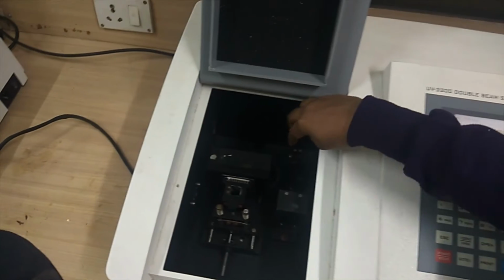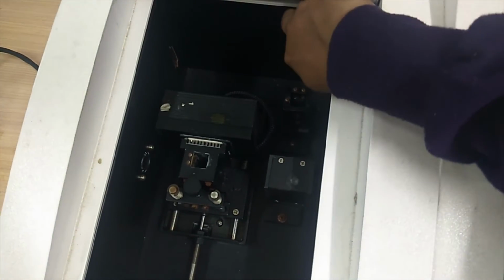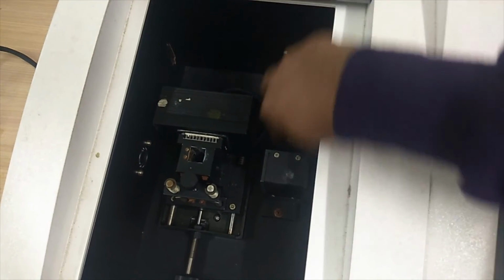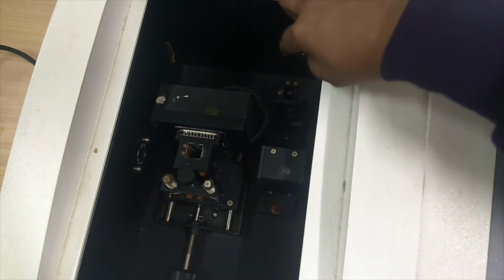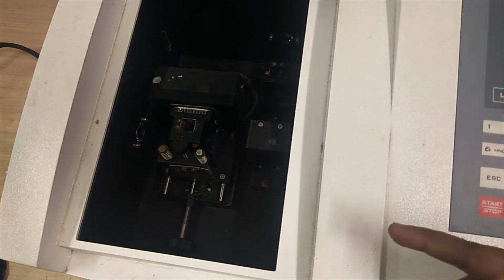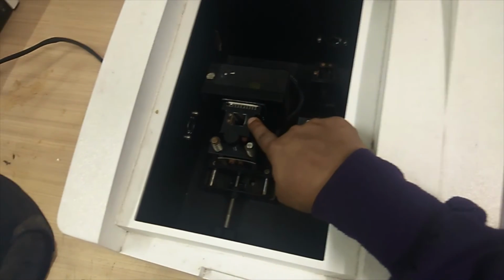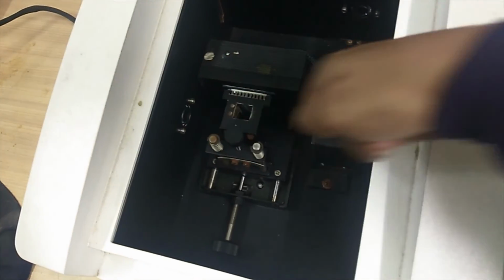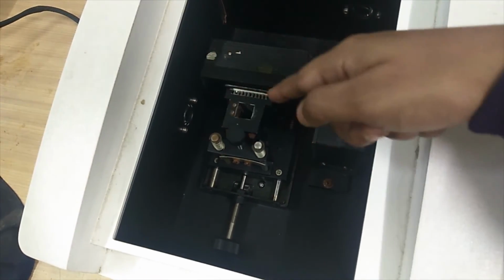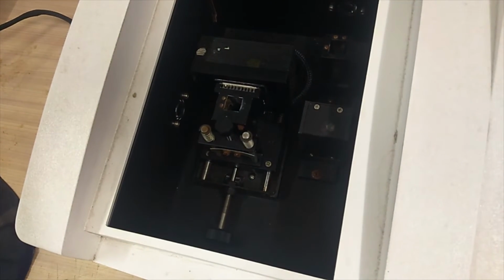So this is the slot for the control sample, and the light always comes here in this direction. This direction and the placement of the cuvette is important, which we'll discuss in the future. And the other cuvette is placed in this cabinet, and the light enters from this side. So that's why we have two beams over here, and that's why the name suggests the double beam spectrophotometer.